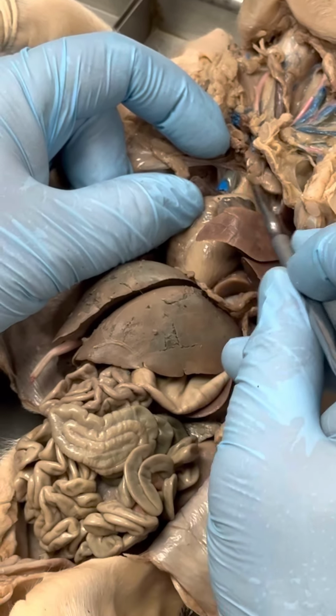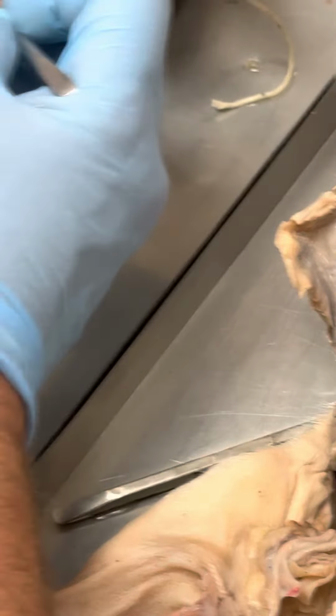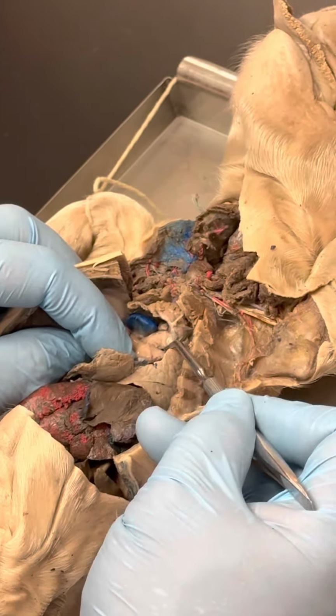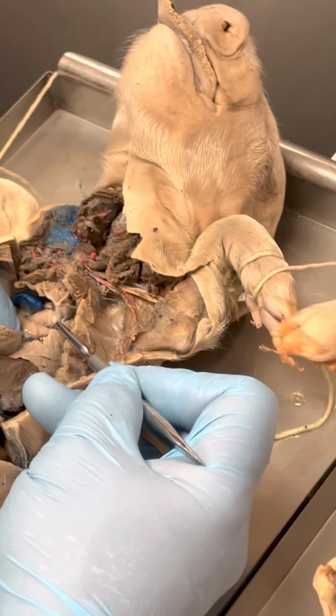Okay. Now, connecting that pulmonary trunk to this aortic arch will be your ductus arteriosus. You can actually see it pretty good on this pig. So I'm going to put it at the tip of this probe. That's your ductus arteriosus. Okay, I went off script, sorry.